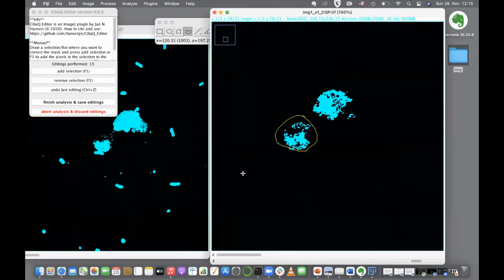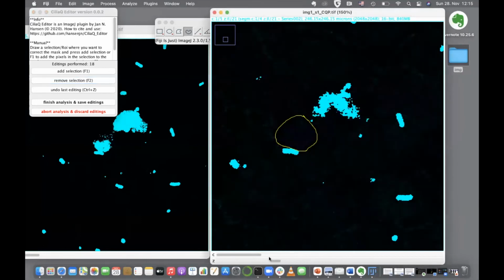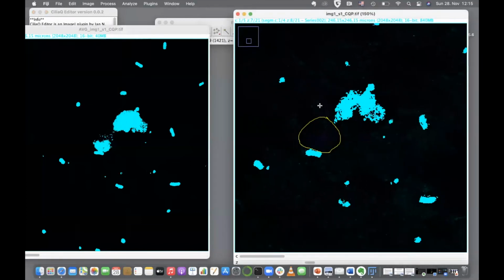And I think two more. And all right, so then you go through the Z plane to check if you actually deleted everything, just to make sure. And yes, okay.